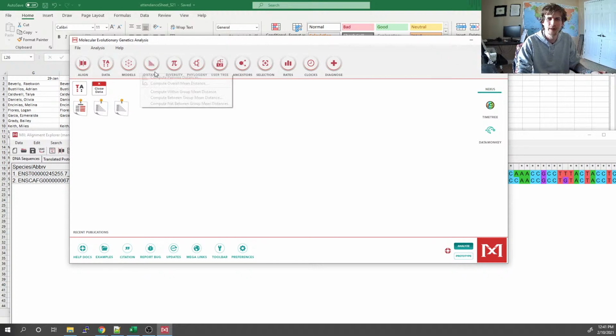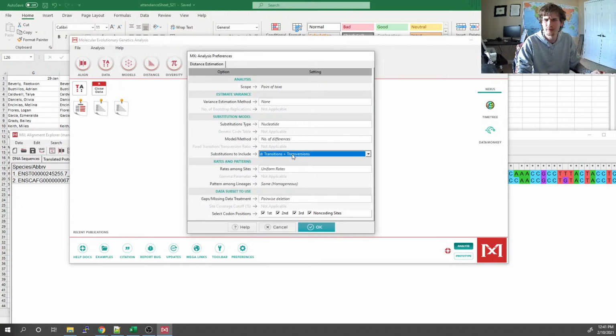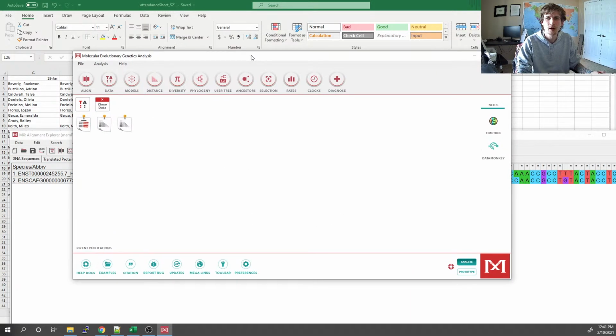So I'm going to leave those two there. I'm just going to do one quick little test and just see what happens. Yeah, that's not good. Okay. All right. First thing we've ever done playing around with Mega, doing some sequence measurements, right? Just counting the number of differences between two sequences and what kind of differences those are. Neat.